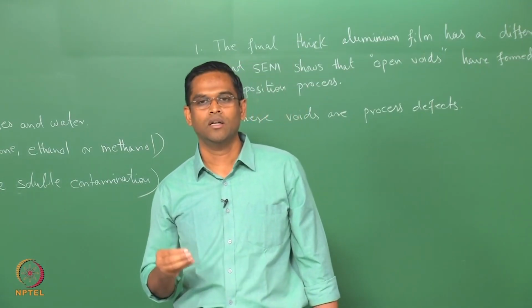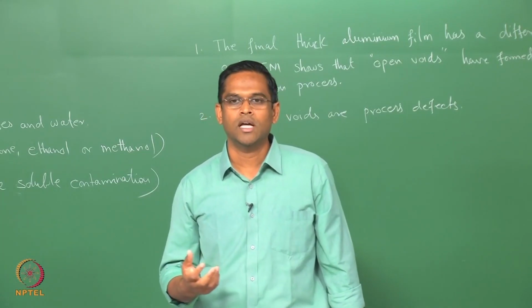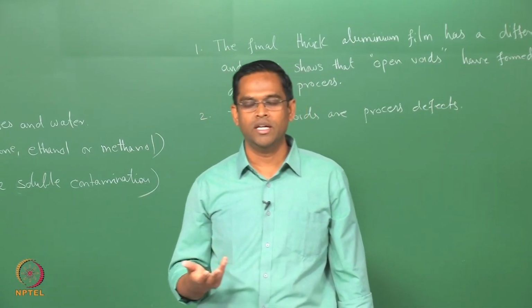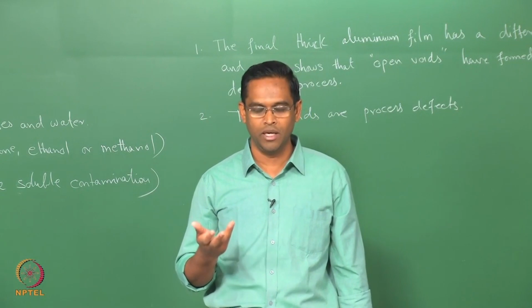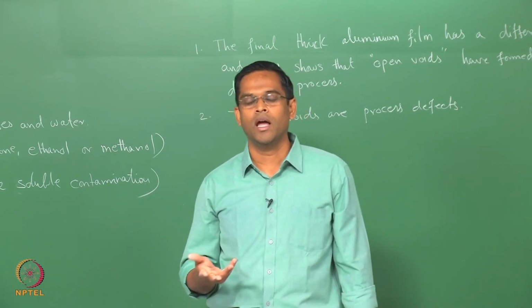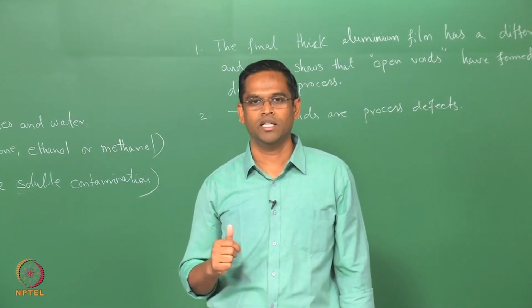If you are interested in higher resolution microanalysis, it is always better to have a WDS rather than EDAX. But EDS has its own advantage, in the sense that it is quite fast and you can quickly find out the result as compared to the WDS, which I have already shown in the theoretical analysis.